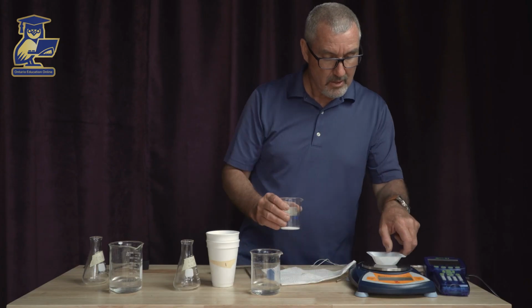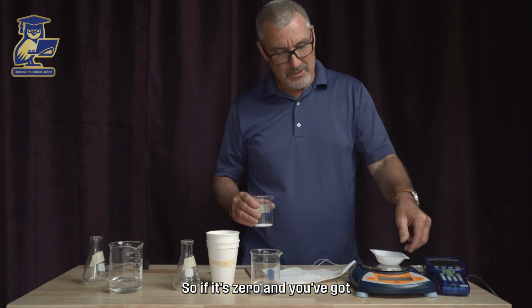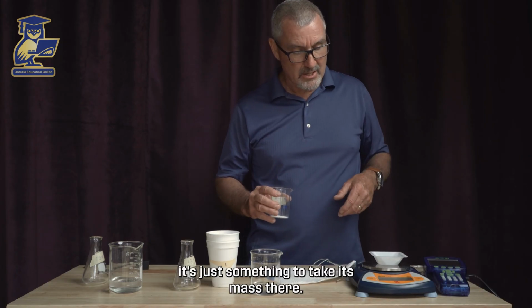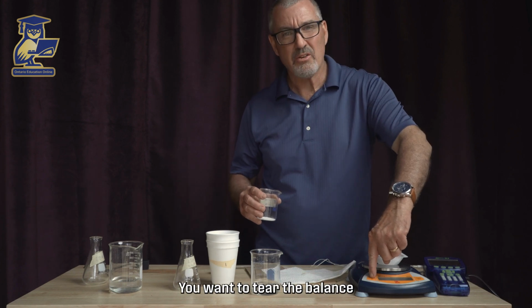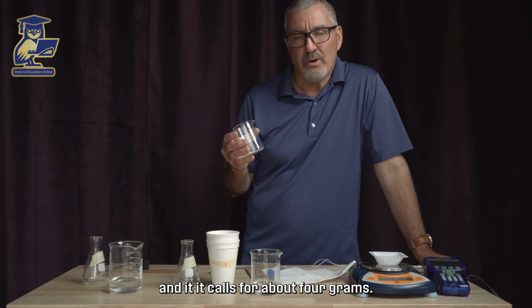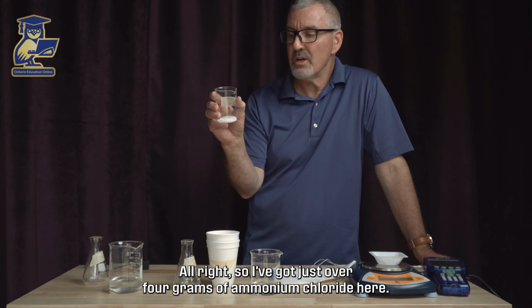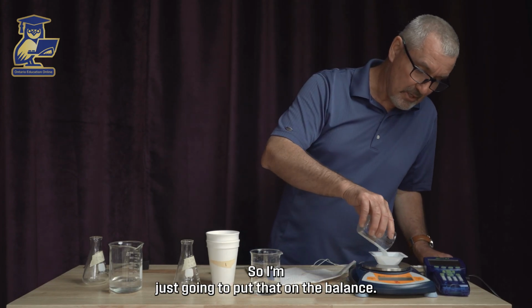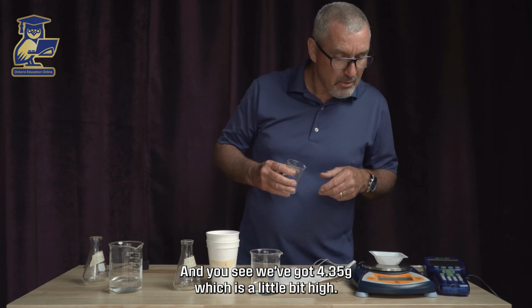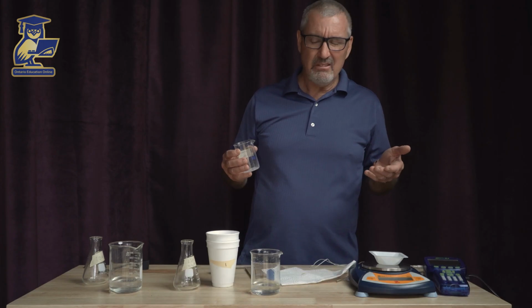And here is our electronic balance. So if it's zeroed and you've got just something to take its mass there, you want to tare the balance, and it calls for about 4 grams. All right, so I've got just over 4 grams of ammonium chloride here. So I'm just going to put that on the balance, and you see we've got 4.35 grams, which is a little bit high. That's okay.